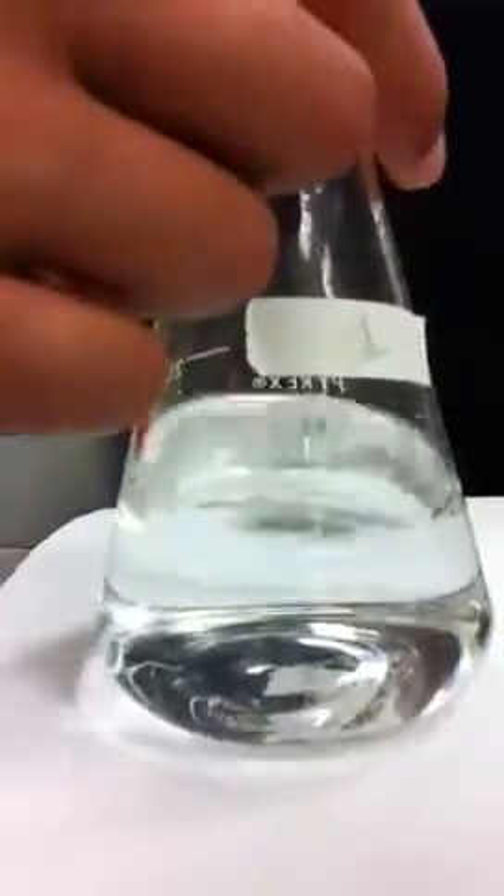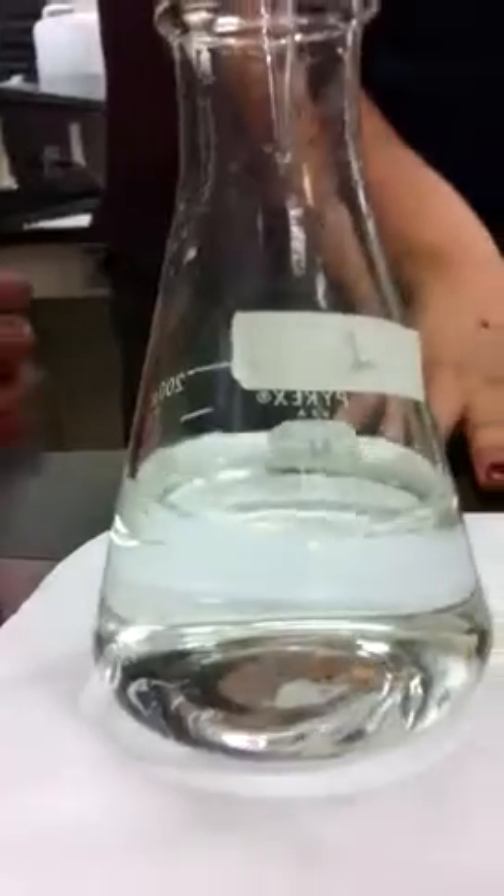We can't tell how many we used after it goes below the bottom of the bar. Put it at the meniscus? I like 0.1 below. So just pour in more.